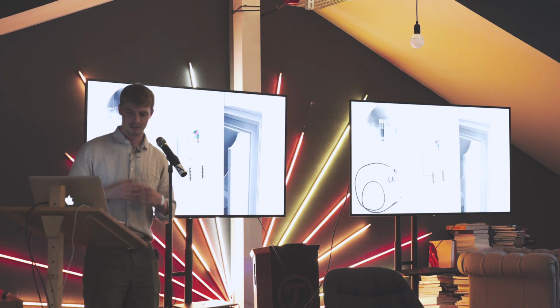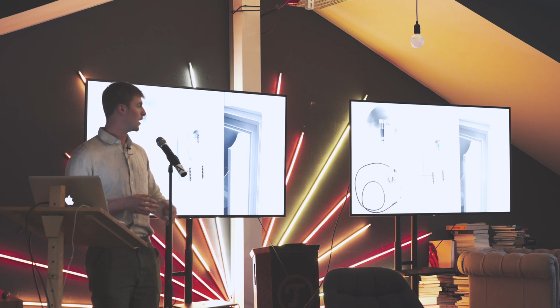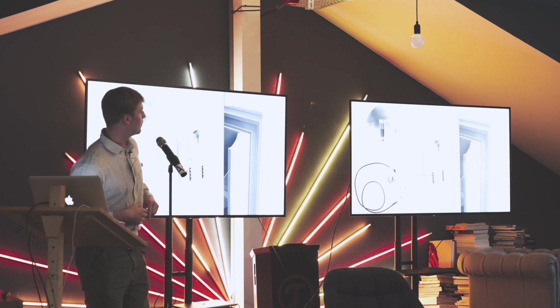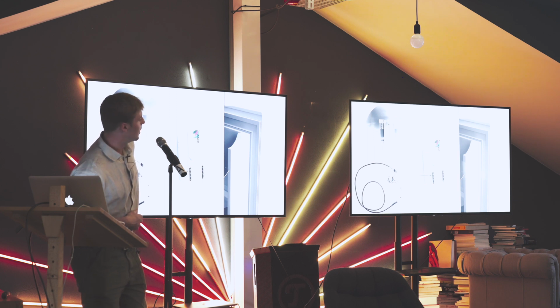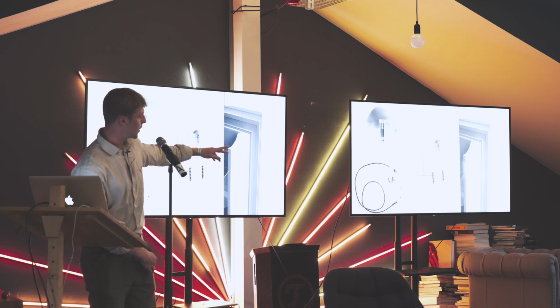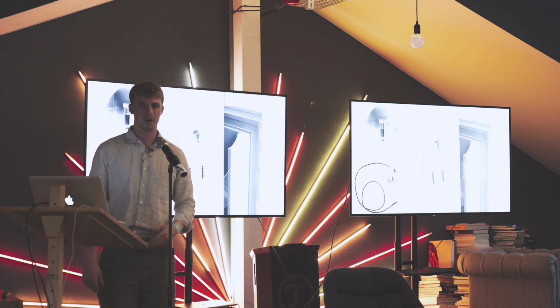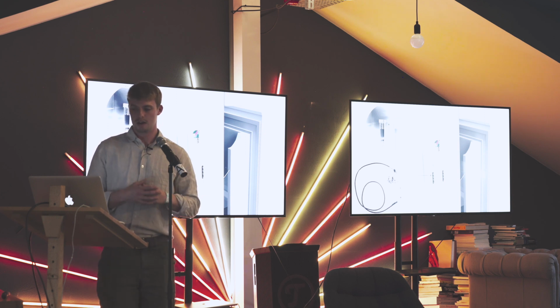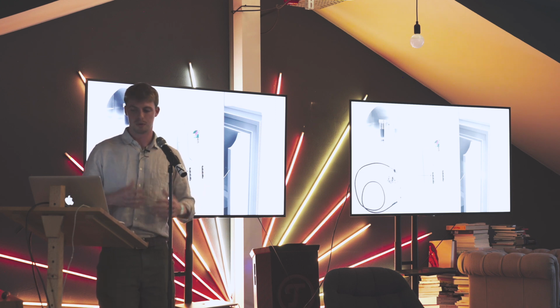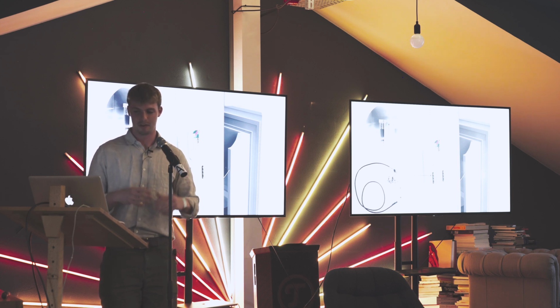This is a temperature sensor that we've created, and you can get all the parts: a waterproof temperature sensor, a resistor that I've very neatly put inside some heat shrink wrap wire tubing, and a battery along with a circuit board. That comes to a maximum of about 15 pounds, and then you have the foundations for creating a sensor. If we manage to get the open source GitHub up and working, you could connect this to the cloud and have a functional sensor within a laboratory for no more than 15 pounds.